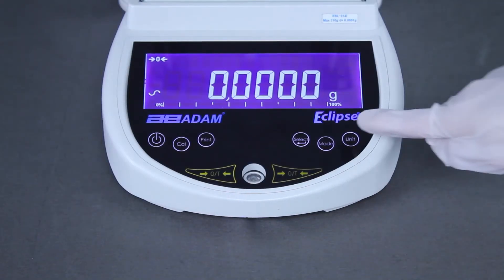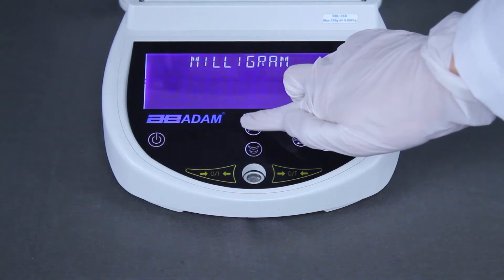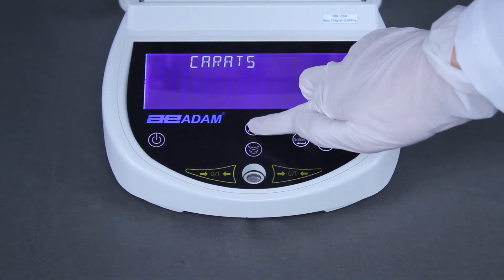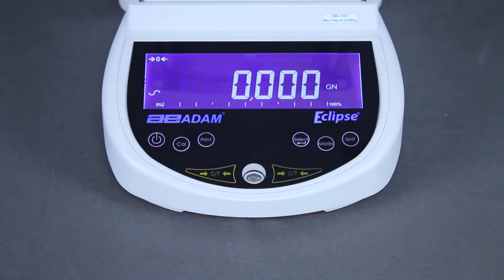The Eclipse's selection of weighing units facilitates numerous lab applications. Users can program a custom unit for more complex unit weight calculations, or disable unwanted weighing units.